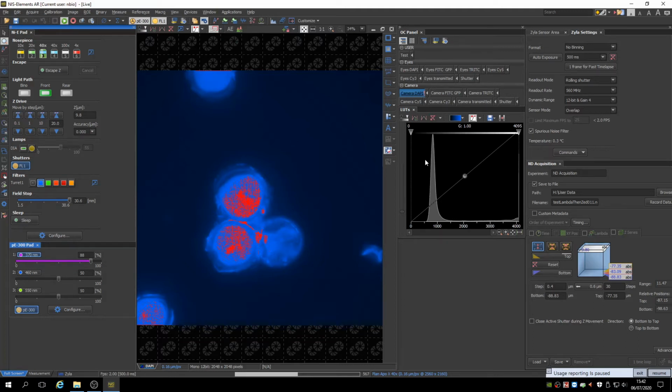Overexposure is particularly difficult as large overexposed regions are not quantifiable in terms of brightness because they are essentially off the 12-bit scale. You'll also lose a lot of structural definition if large clusters of pixels are at their maximum. To rectify the overexposure shown here, I can either decrease the exposure or decrease the light intensity.